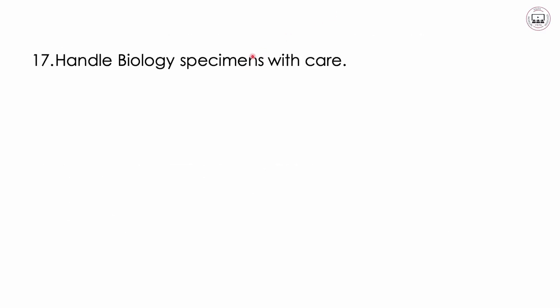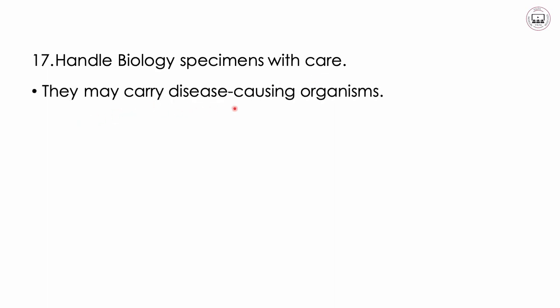Now, point number 17, handle biological specimens with care. This specimen might be live or dead ones. Why? Because they may carry disease-causing organisms. And to add on that, they might also be dangerous themselves. They can bite, they might cause irritations, and they might bring so many things on your health.